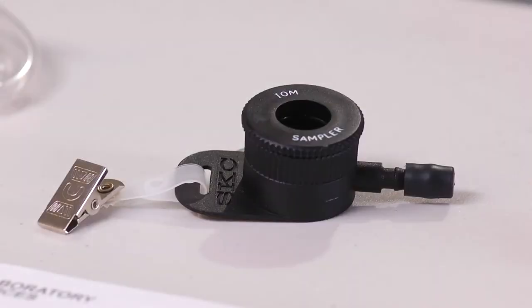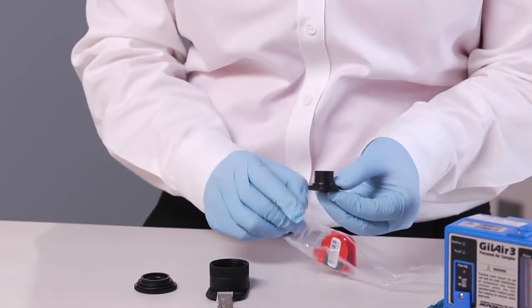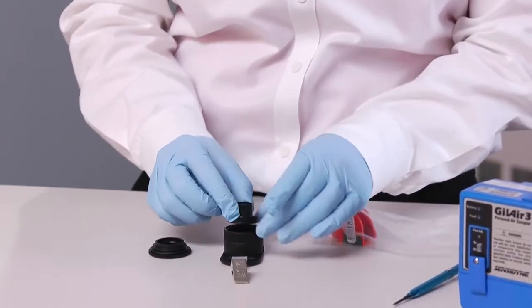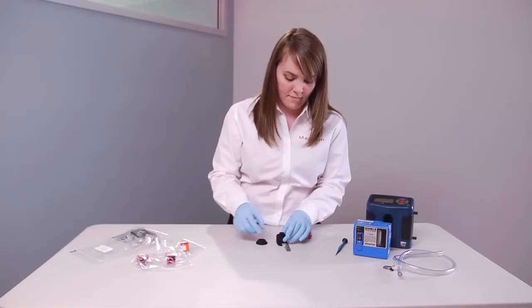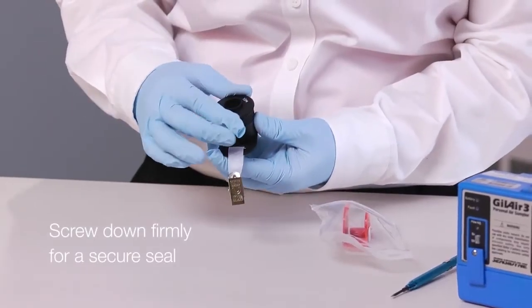You can also label the back of the IOM sampling head to ensure cassettes are not mixed after sampling. Remove the protective cap and place the cassette into the IOM sampler and replace the faceplate, screwing it down firmly for a secure seal.